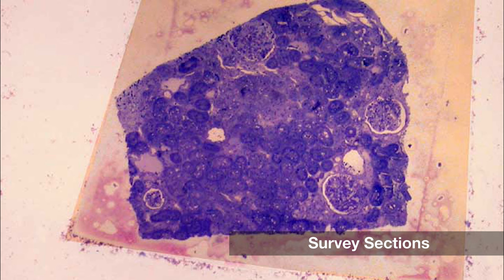Survey sections are examined with the light microscope to locate the area of interest and to check the orientation and preservation of the tissue.